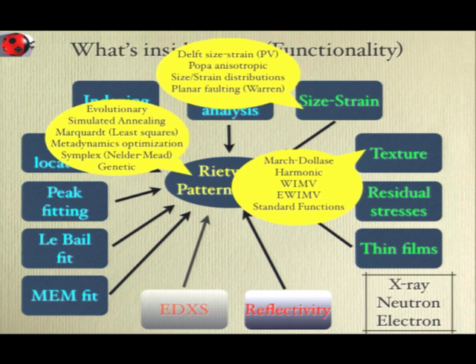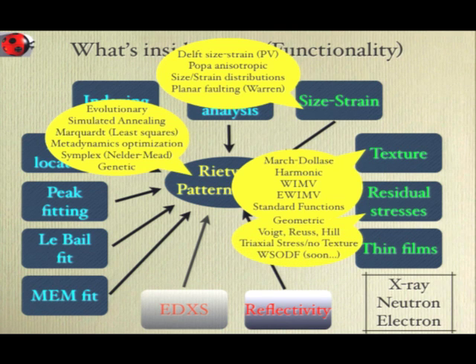Texture, yeah, the classical Harmonic, WIMV, E-WIMV, these are not based on a function, but discretize the ODF, or the standard function. And actually also the exponential harmonic in addition.